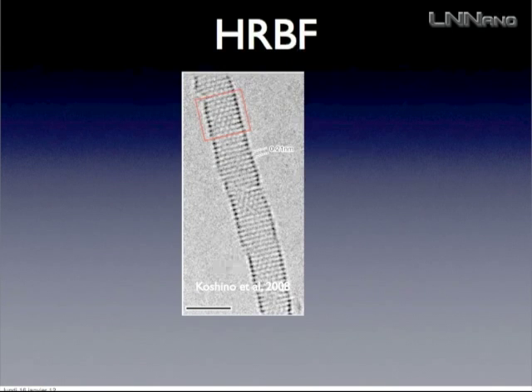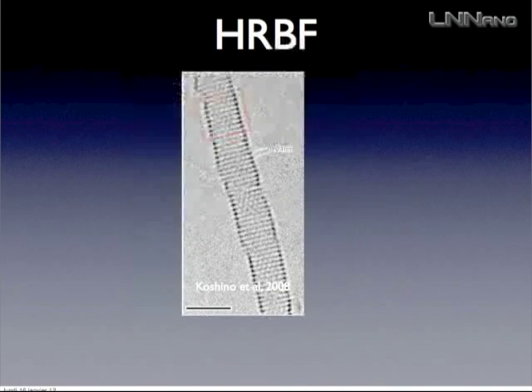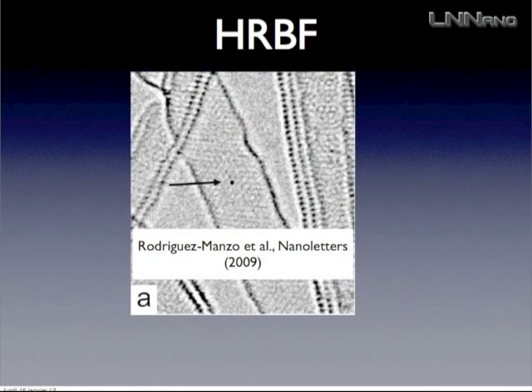So this is not a proof, but it's just to say that now it's a reality. So this is an image made by a corrected machine, maybe a TEM, maybe a STEM, and exactly the same. Well, here it's another kind of carbon nanotube, but it's a corrected machine by another brand of machine. And in fact, this is parallel beam high resolution TEM, and this is a bright field convergent beam TEM, STEM, and there is not much difference between both of them.